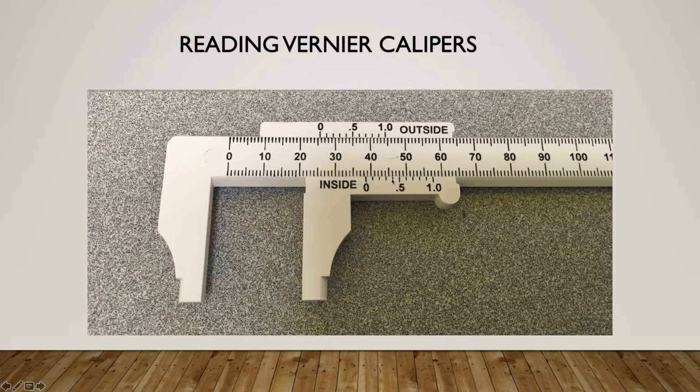But it looks like the 4 is kind of spot on, right? And the 5 is very close, maybe just a tiny bit off. And then like again, the 6, 7, 8, 9, 10, none of those are lined up very well. So what this is basically telling us is that our decimal place for our measurement here is going to be either a 0.4 or a 0.5. Can't really fault you necessarily for picking either one. It's very close. I'd probably say 0.4, but again, it's very close on either one of those.